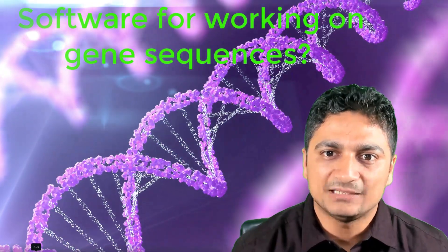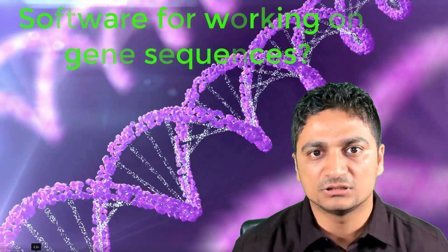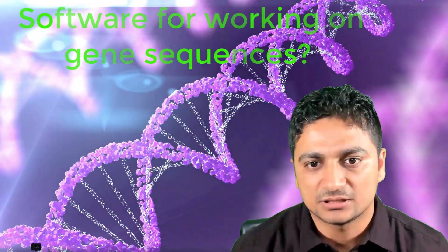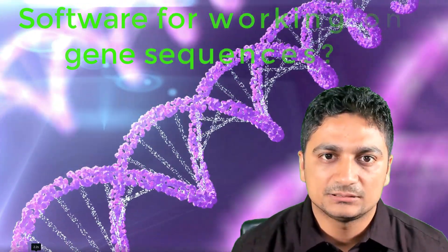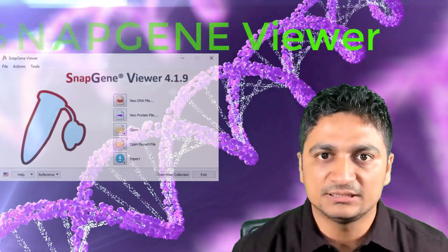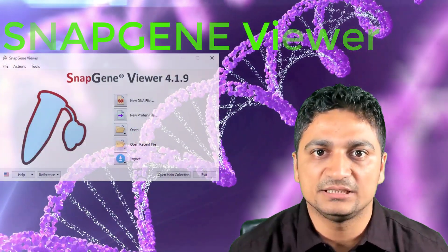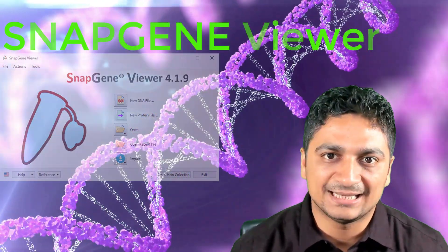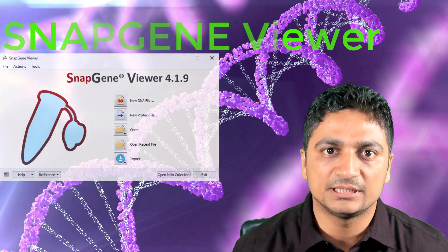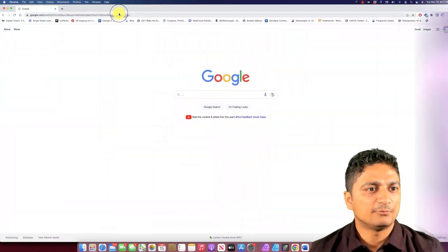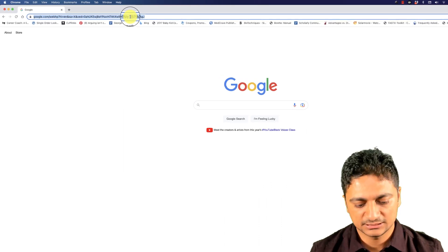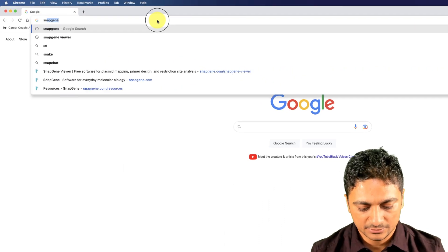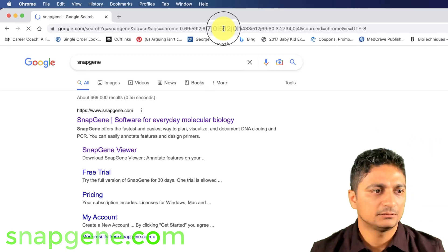In this series, what we will do is first identify a software where we can work on sequences, and we'll identify a free software. In this video we'll be talking about SnapGene Viewer. You can download SnapGene Viewer online and install it on your computer so that you can work on different sequences. I have opened the Google browser for downloading SnapGene Viewer — just type SnapGene here.